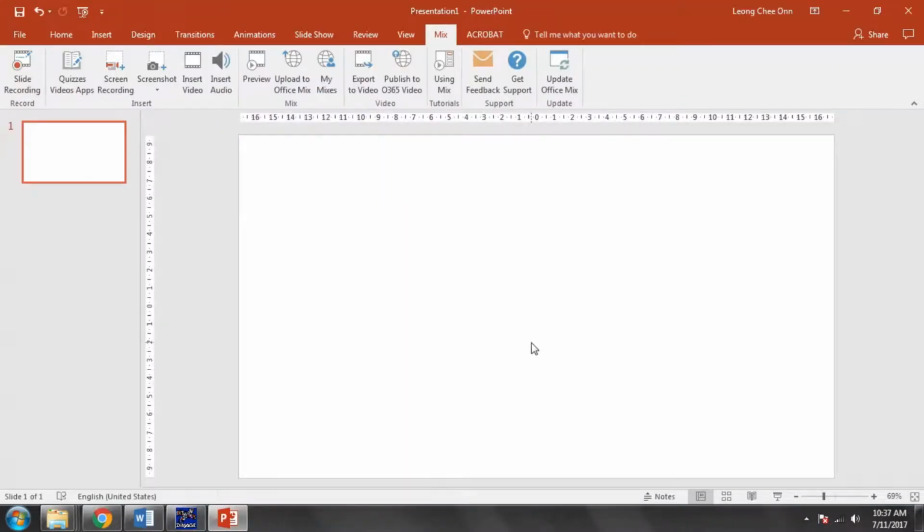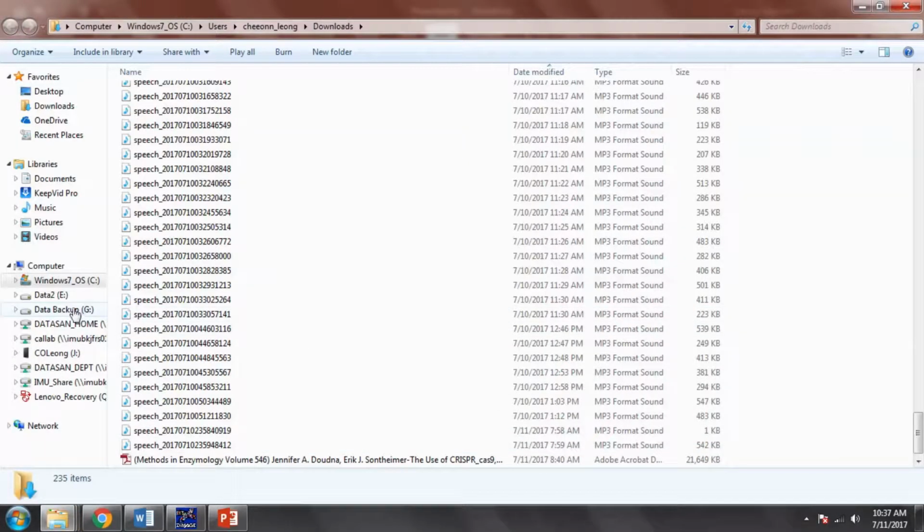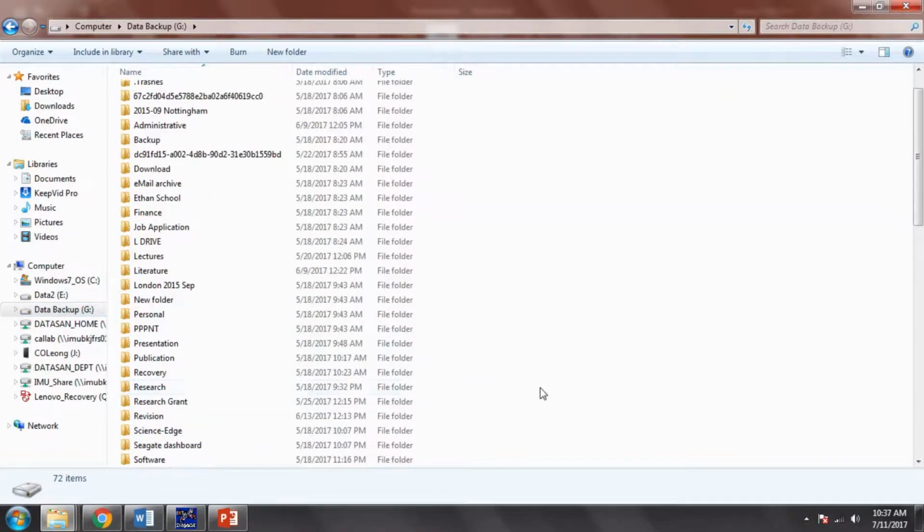Okay, so in this exercise, what we are going to do is classify the different cell lines into different subtypes. We need two sets of data here. One is the ICGC data for pancreatic cancer, for which you have already identified all the subclasses, the subtypes. Another is the gene expression profiling data from the CCLE. All right, so now I'm just going to import the data that we have previously.